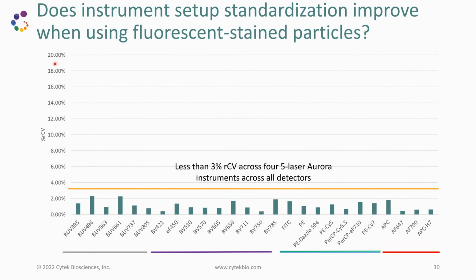Well, that was the scale of the first set of data, and we were having things around the 14%, if you remember. Now, everything is below 3%. Even below 2%, I could have been more stringent, but there is 1 or 2 that are a little bit above 2%. So the level of agreement that we can get at the fluorochrome level of the fluorochrome stain particle is significantly better. But again, there are some caveats, and it's not so easy to achieve these across sites.